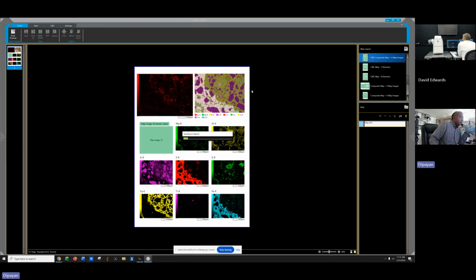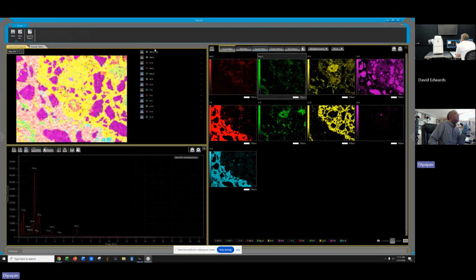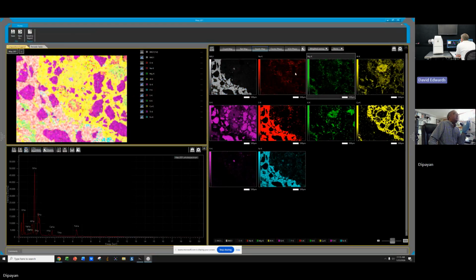But look how horrible this is. This is what I really have to play with. What happened there? Right. So here, oh, no. You took, I have to have 1 there. Yeah. And then I have to get rid of.